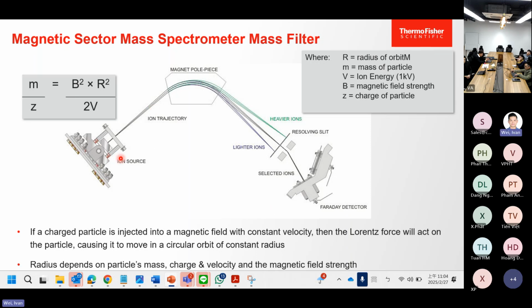In this case, the Prima Pro and Sentinels have magnet sections that will give different magnetic fields. The magnetic fields will affect our ions and give them different trajectories. Later, we have detectors here that are able to detect which compounds come in and at what concentrations, and then we use the computer to process the signals to know the concentration of that particular compound or particular fragments.